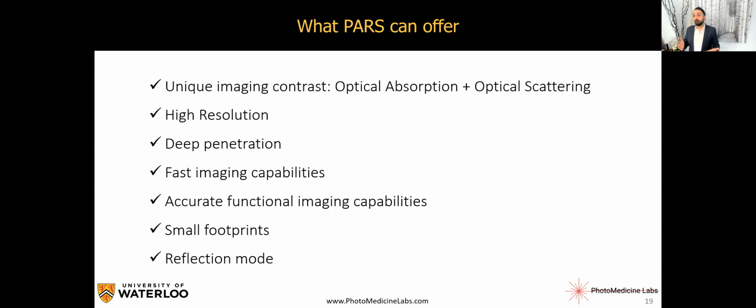This is still in phantom, but compared to, let's say, 0.5 millimeter to 1 millimeter, we believe that by just selecting the right detection wavelength, only that, and there are other things we can do and we are doing, we can increase the penetration depth a few times, which is very important.